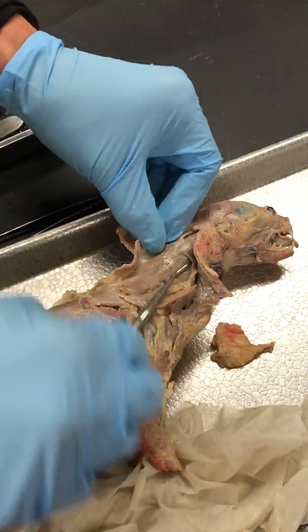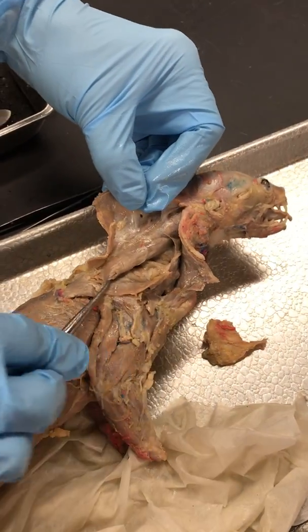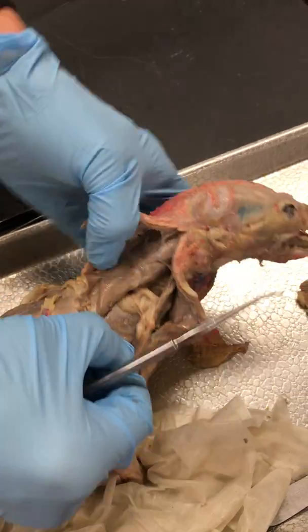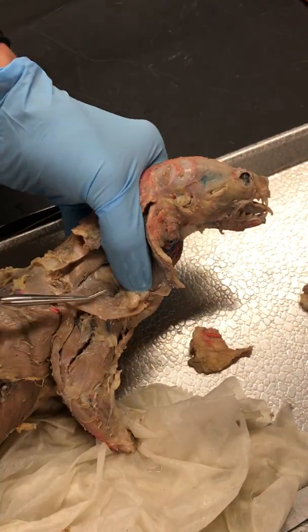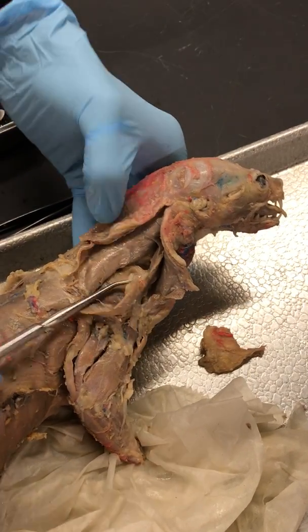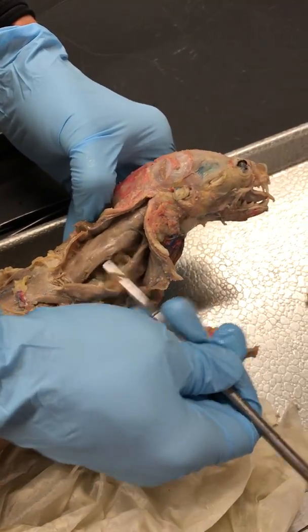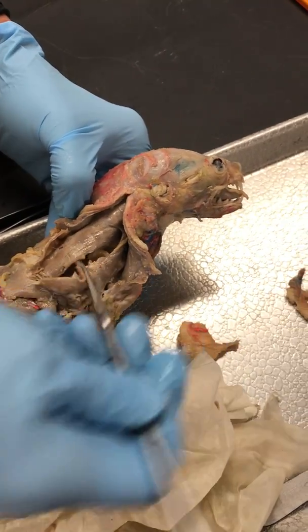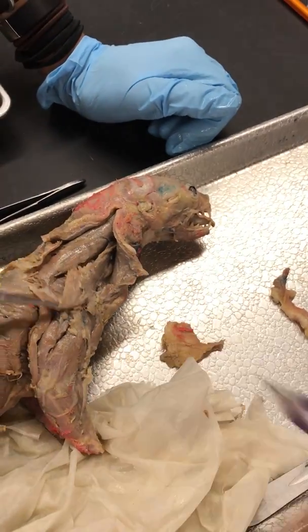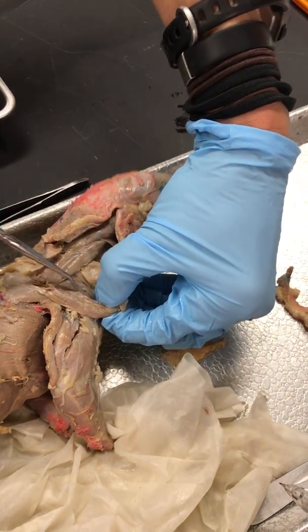Levator Scapulae looks very similar to Homo Transversarius, but if you look at where it goes — it goes over to the Supraspinatus of his shoulder, so that's above the spine of his scapula. This big meaty muscle is the Supraspinatus, and Levator Scapulae runs over to that Supraspinatus. And then that's Supraspinatus right there.